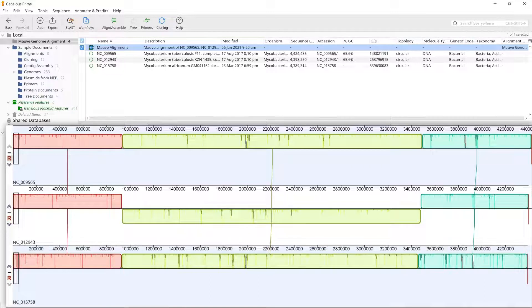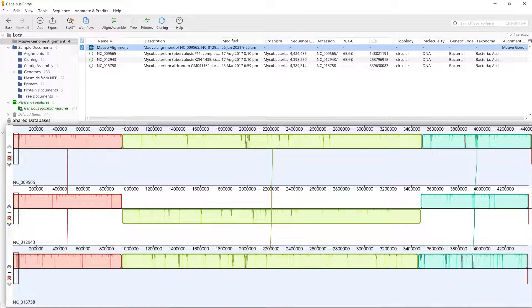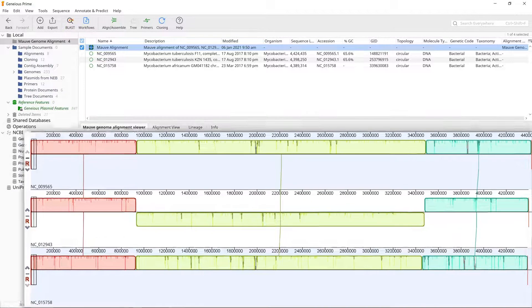In the middle LCB, the block in sequence NC_012943 is below the line. This indicates that this region is inverted with respect to the other two sequences.